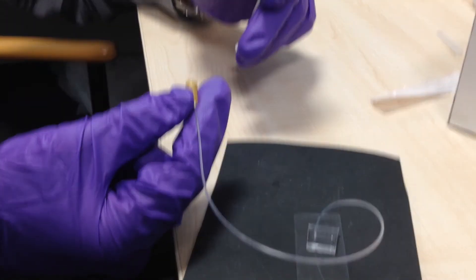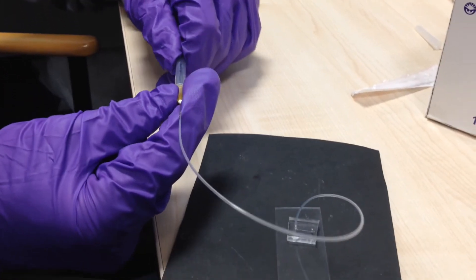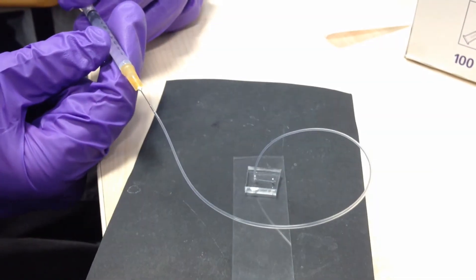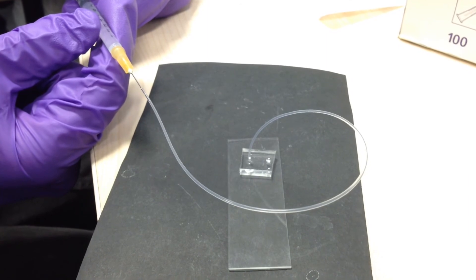And then to introduce some fluids to the device, this is just distilled water. Take a syringe, put it onto the needle tip, then gently push through. The tubing fills, then you can see water is starting to come out the other end of the microfluidic channel.